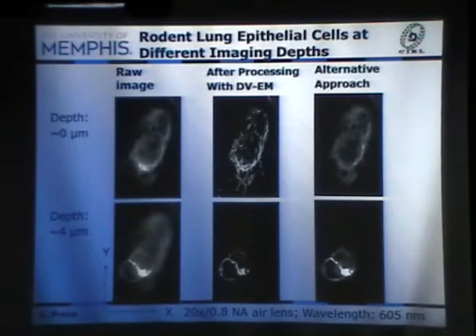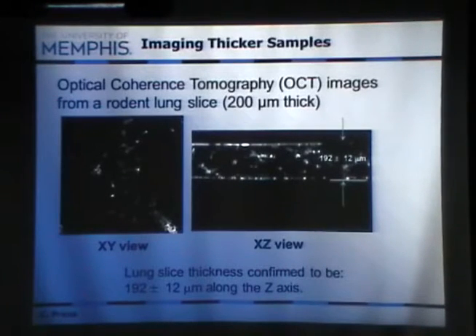And again, this is a work in progress, and we're continuing to evaluate, but we're happy to see that we're achieving, as you see, a larger range of intensities here. That's why you see a better contrast in the image and less noise. Okay, so I think that this is a good place to stop, because I folded these results in the other talk, and I kind of split it into two.